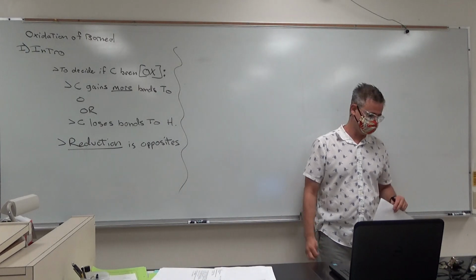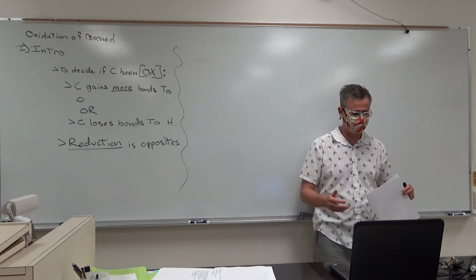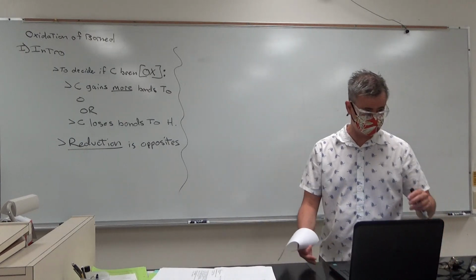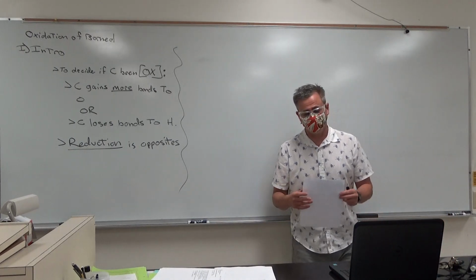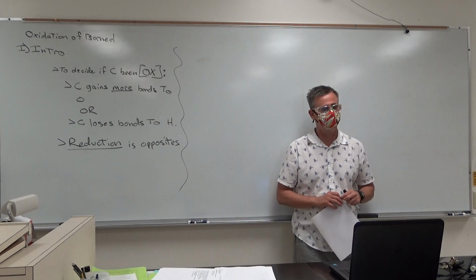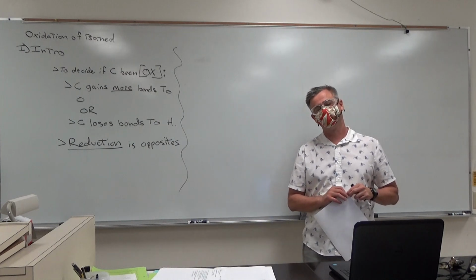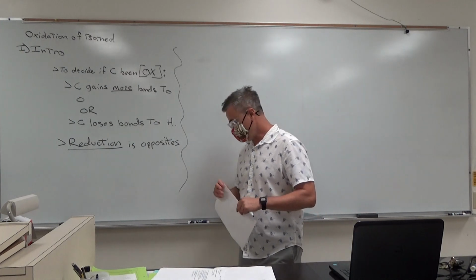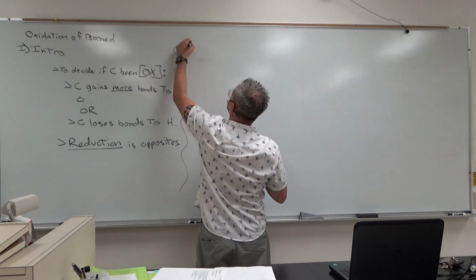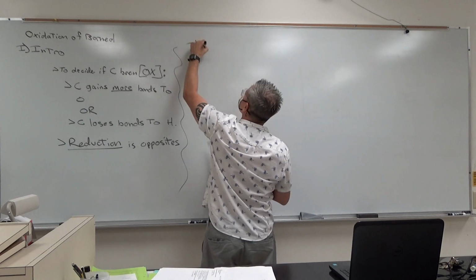Well, I don't know about super, but they were toxic nonetheless. And sometimes these reactions you've got to do on a large scale. We're doing this in the teaching environment and stuff. So alternative reactions were developed, and in particular, hypervalent iodines. What hypervalent means is it's an iodine with more bonds than it typically has. Okay?